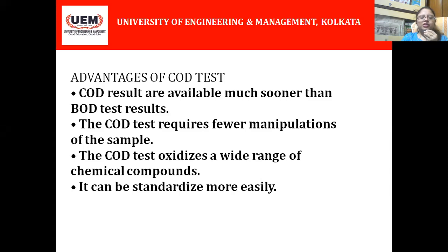Now, these are the advantages of the COD test. COD test results are available much sooner than the biological oxygen demand test. COD test requires fewer manipulations of the sample. COD test oxidizes a wide range of chemical compounds and it can be standardized more easily.